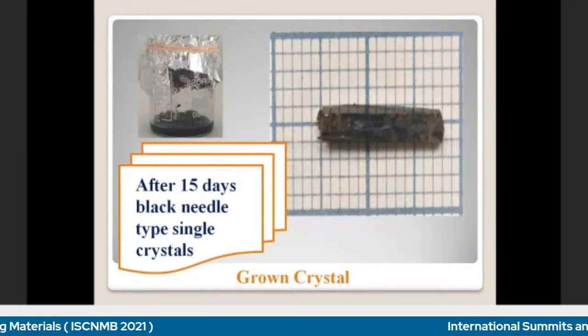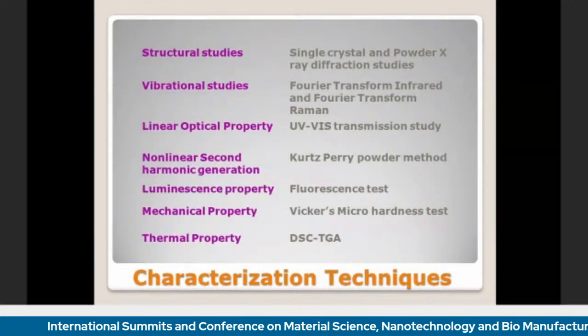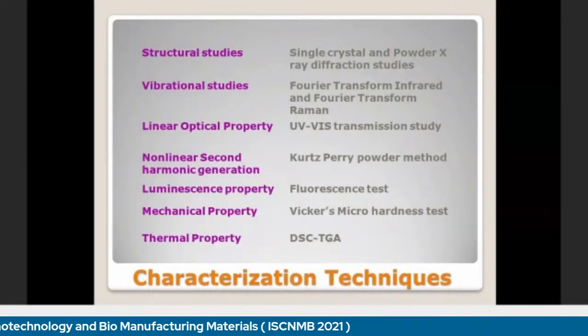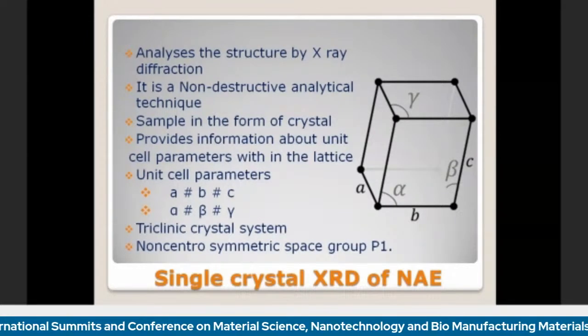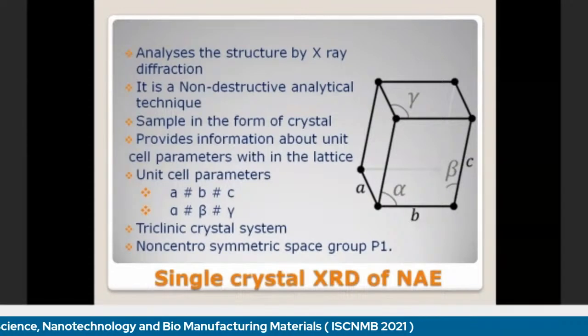The grown crystal was subjected to various characterization techniques: structural, vibrational, linear optical, nonlinear optical, luminescence, mechanical, and thermal, to analyze its properties and find its use in various fields. Using X-ray diffraction analysis, the structure of the sample was obtained. It is a non-destructive analytical technique. There are a number of methods used in X-ray diffraction. In single crystal XRD, the sample is in the form of a crystal. It gives information about the unit cell parameters within the lattice.